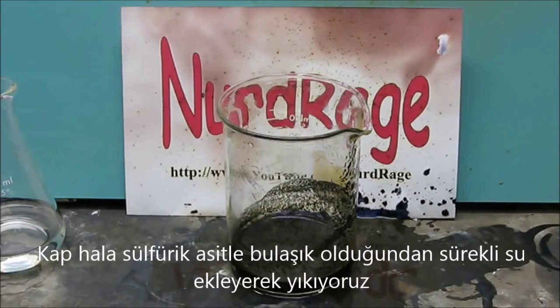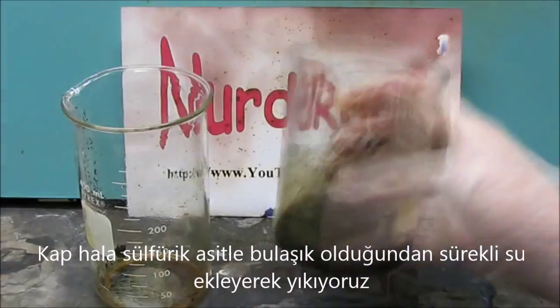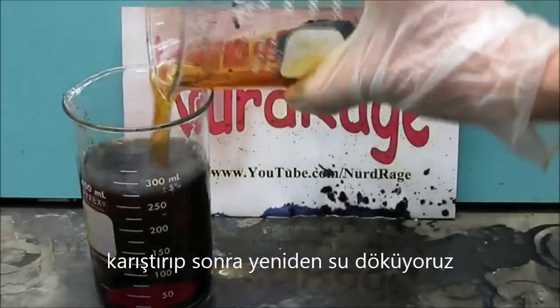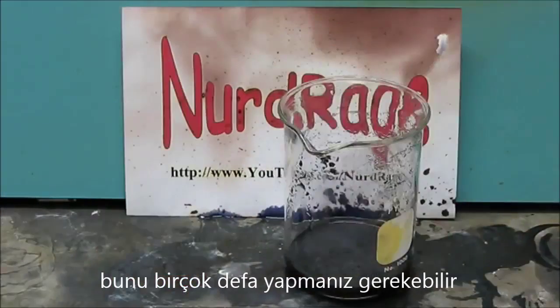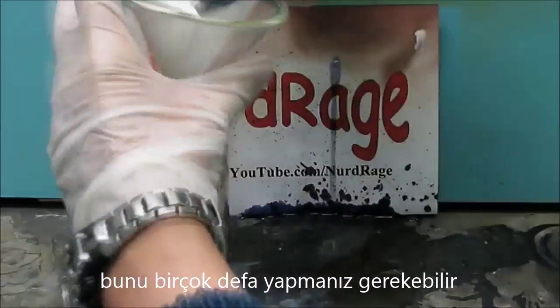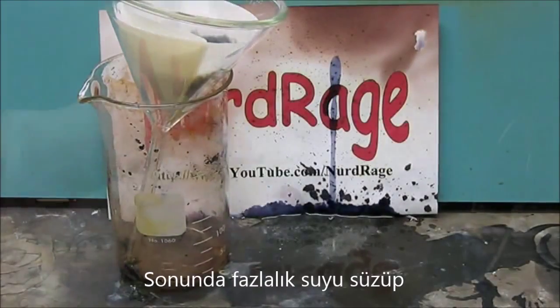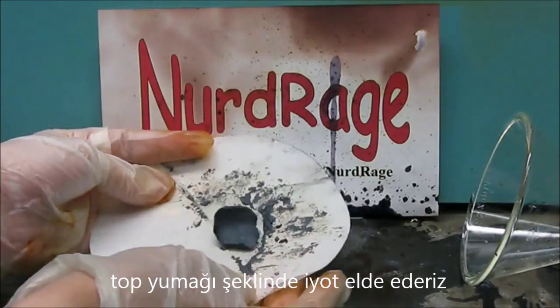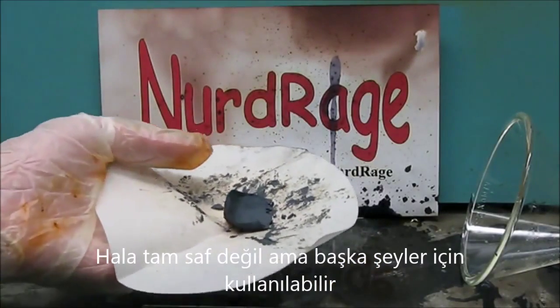Since it's still highly contaminated with sulfuric acid, we wash it out by continually adding water, mixing, and then pouring off the wash water. You might have to do this several times. Finally, filter off the remaining water. And now you have a pellet of iodine. It's still impure, but usable for most purposes.